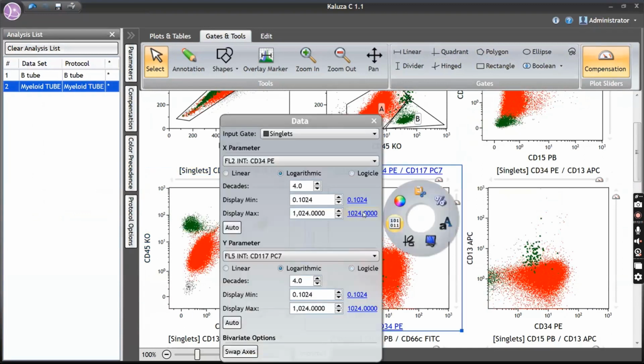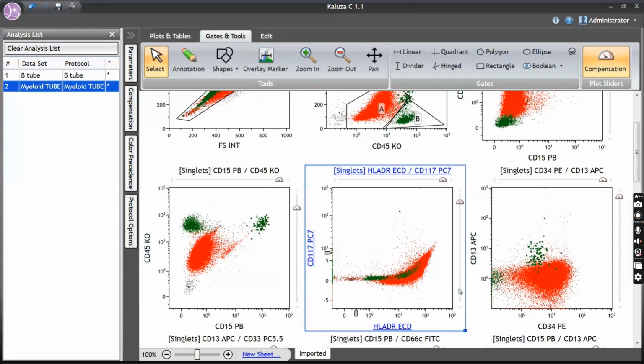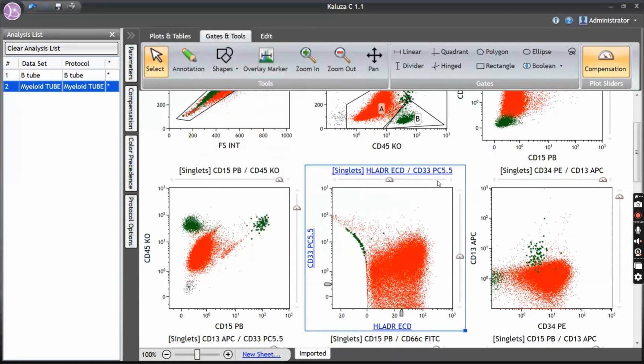Right, now faster. We'll move faster. Now see, these are all compensation. You can see that skewing of data. Specifically, I want to show you that, so I've taken some uncompensated data so that you can see it. These are things you need to learn when you're doing an analysis: how to do the compensation, post-acquisition compensation.